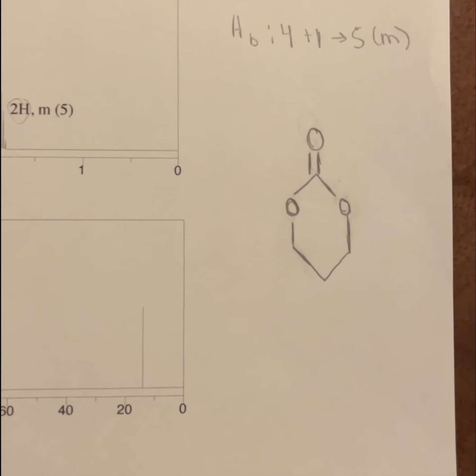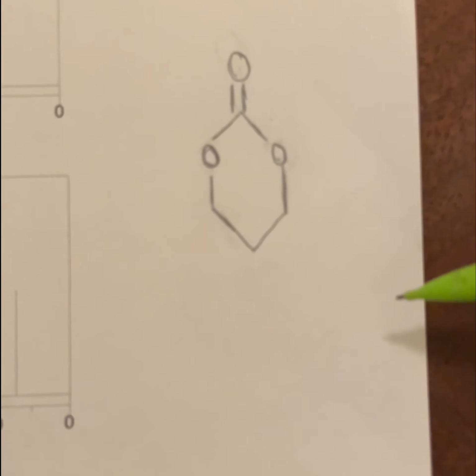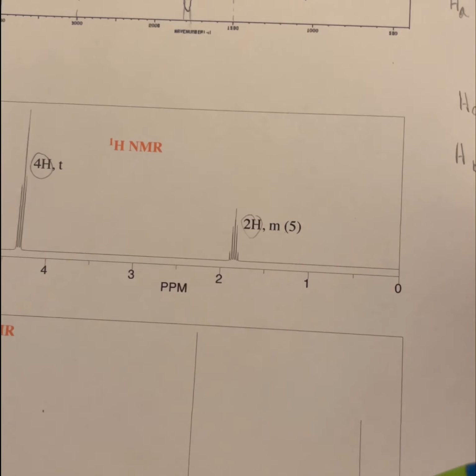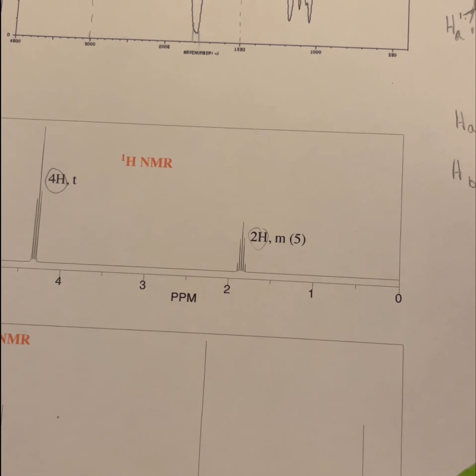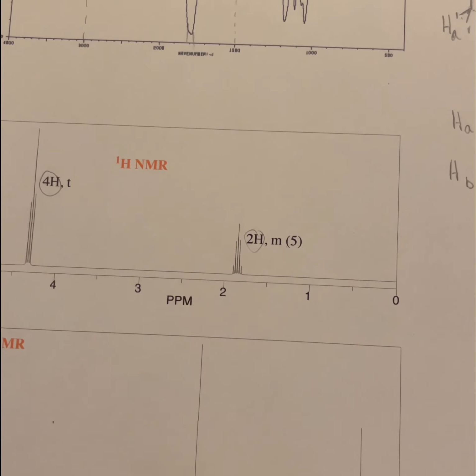So after cleaning it up and redrawing it, I just wanted to say again that this is my final structure, and I concluded that by going between each chart and confirming with each section that I drew that this was a valid structure.